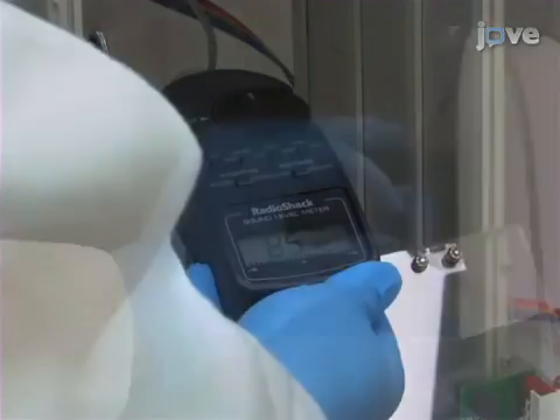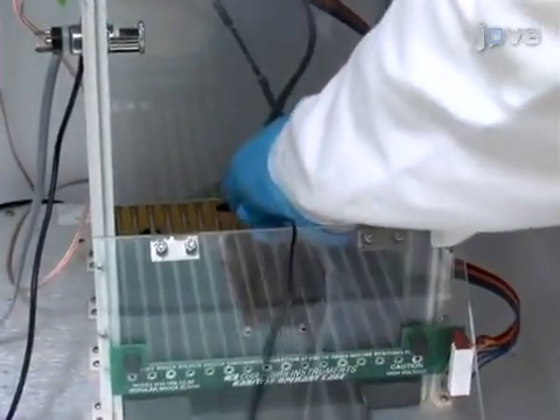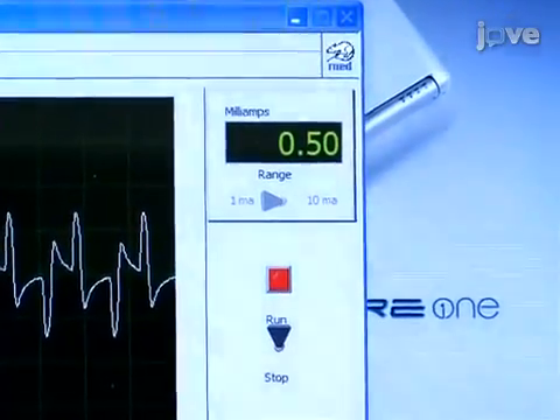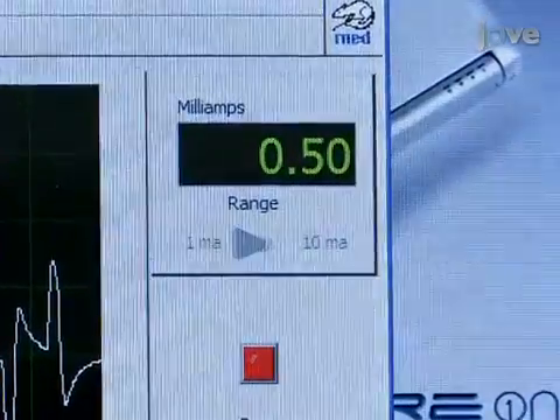Next, calibrate the tone used during training. Use an external calibration device to calibrate the shock level. Place one lead on a bar and another three or four bars over. Use the shock generator to administer the shock and calibrate until the correct level is achieved. Repeat this step for each chamber.